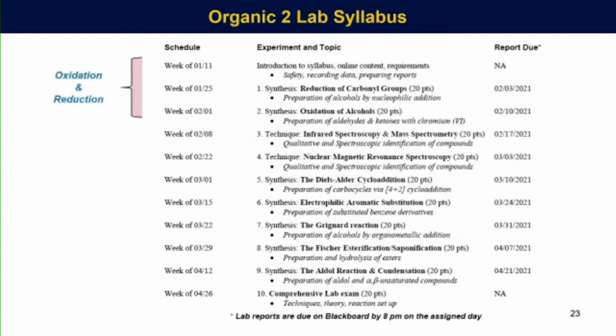The way I've got it set up here is a couple of weeks of synthesis. And then in the textbook, we go into spectroscopy and spectrometry. Of course, Beyond Labs is going to be useful for that. And then we finished up with a whole bunch of reactions that are classic at the end, doing synthesis.